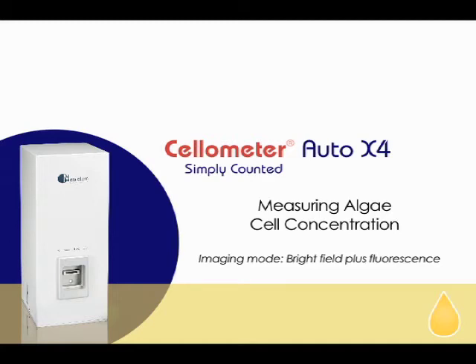Measuring algae cell concentration from a pond water sample using Cellometer AutoX4. The imaging mode is bright field plus single fluorescence.